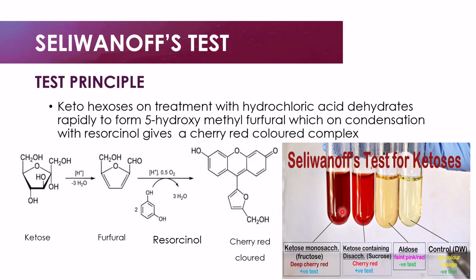So these are the cherry red colors being seen over here, indicating a positive test result for Seliwanoff, and these are a faint pink red or no color change, indicating a negative test result for the Seliwanoff test.